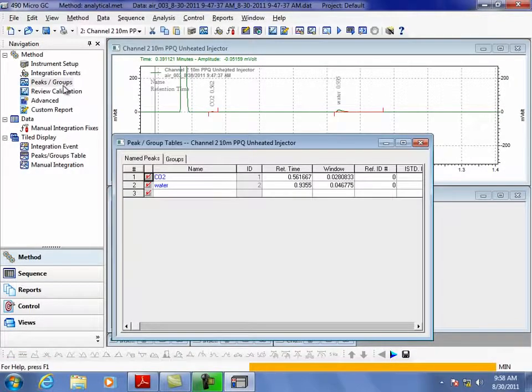The next thing that you'd normally do on a system would be to calibrate these peaks. But we can't really calibrate the peaks because we don't know how much there is. And we can guess that there's somewhere between 360 and 400 parts per million of CO2 in the air. I think it was 320 when I was growing up. It was down around 300. I know it was 320 or 340 when I started in chromatography. And now it's up to about 400.